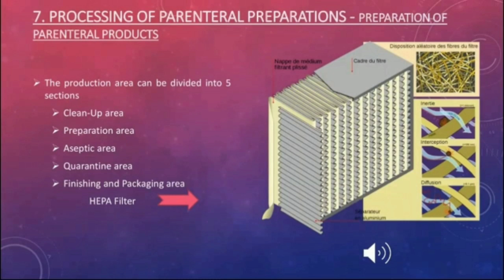0.3 microns. HEPA filters are fitted in a laminar airflow system in which air free from dust and microorganisms flows with uniform velocity. Ultraviolet lamps are fitted in order to maintain sterility.